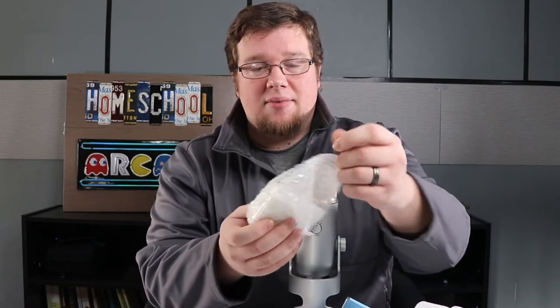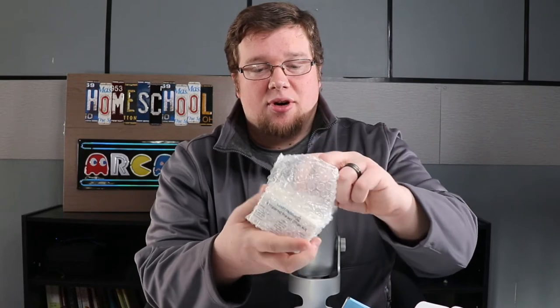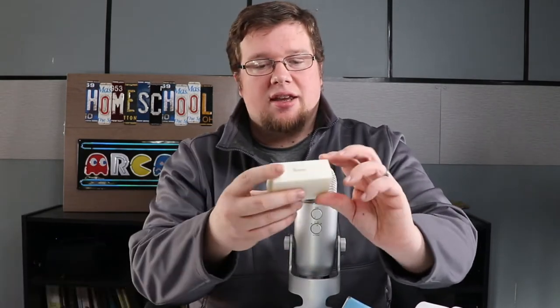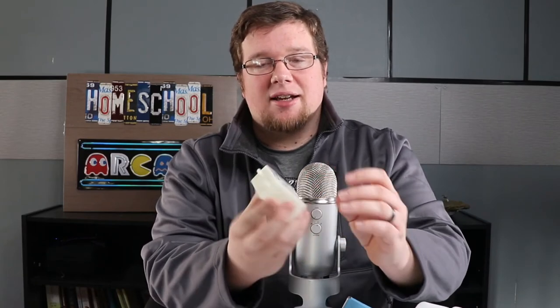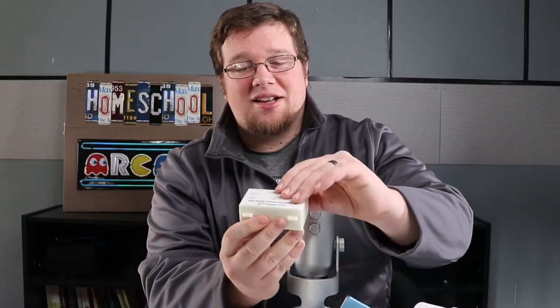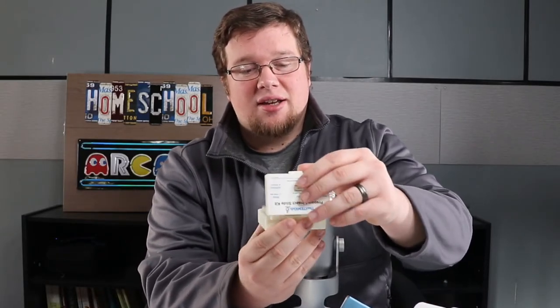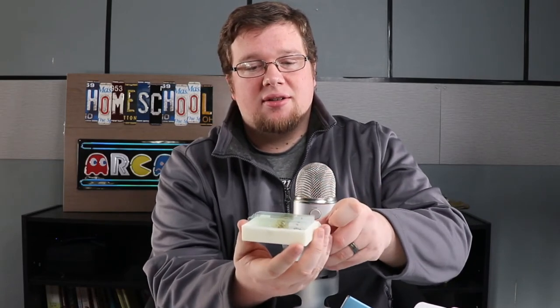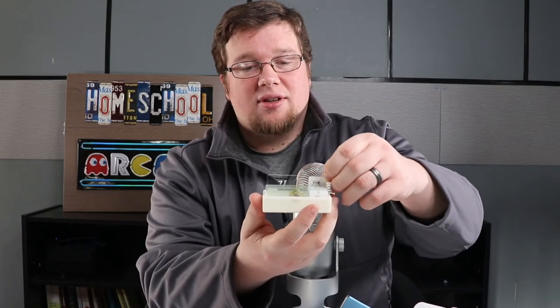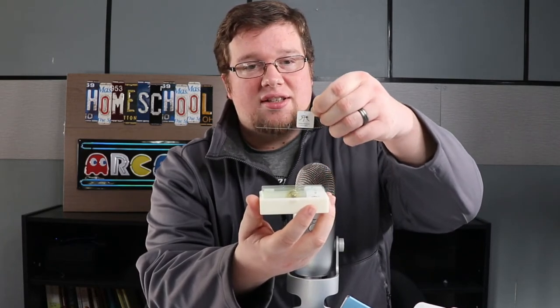We also have additional slides to go with our microscope. This is the STEM Kids prepared insect slide kit. What's nice is that this slide kit actually includes a list of all the different slides included for your kids to interact with and to see what's out there. I think I'm probably going to do this myself because it's very interesting — and if you look at it, it's very neatly put together.